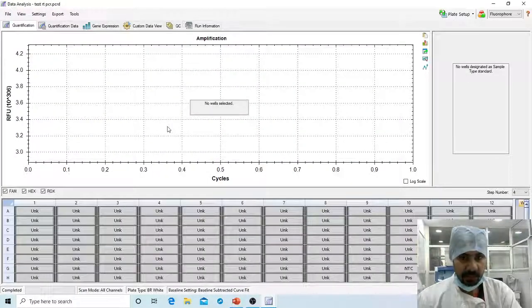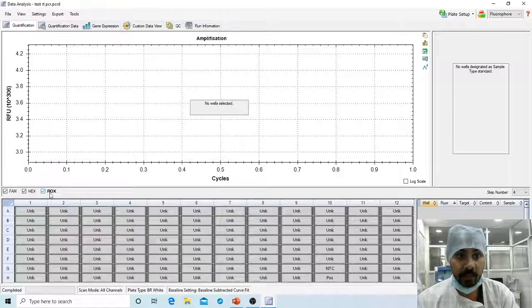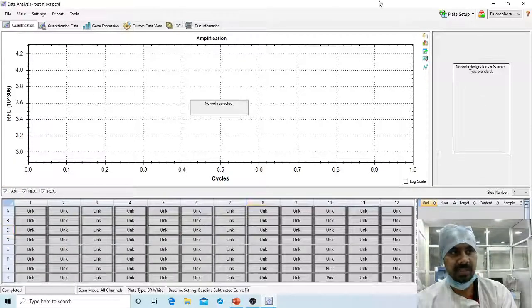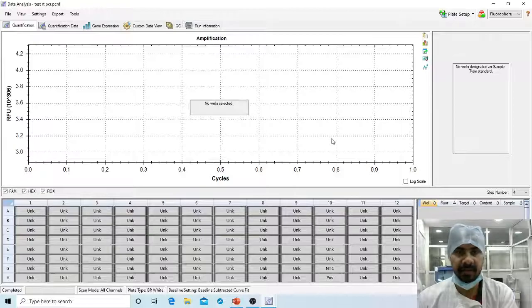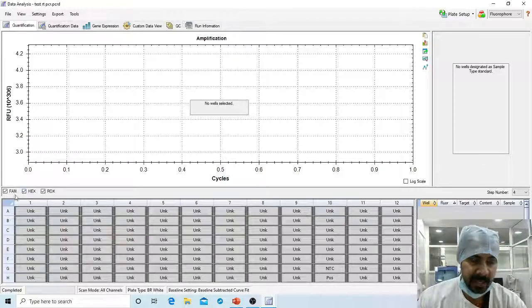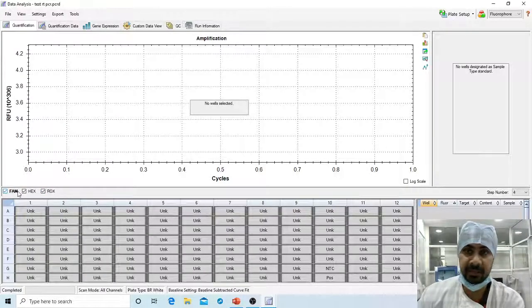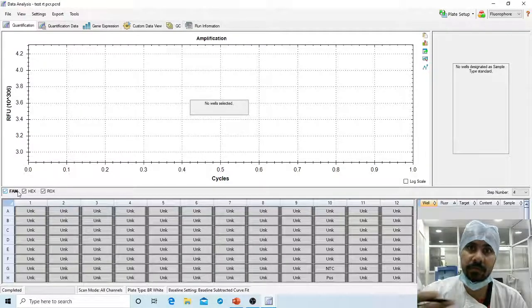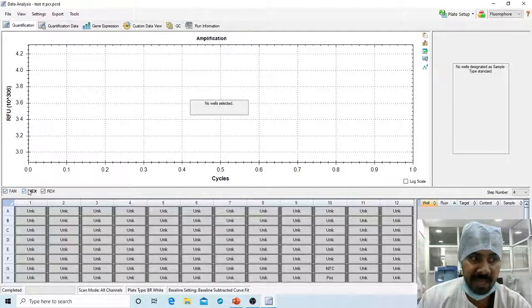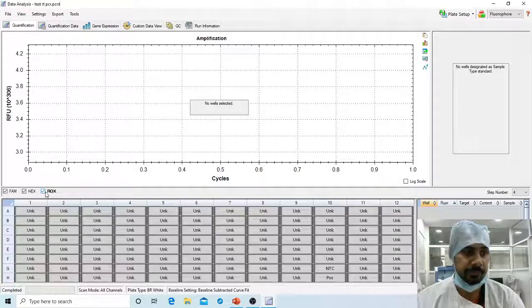This is the direct CFX software file. There are three targets as already discussed. You need to label the targets, and the machine shows you the fluorophores. When the run is complete you will get this type of screen. The three targets selected are FAM for ORF1ab, HEX for N gene, and ROX for the internal control.